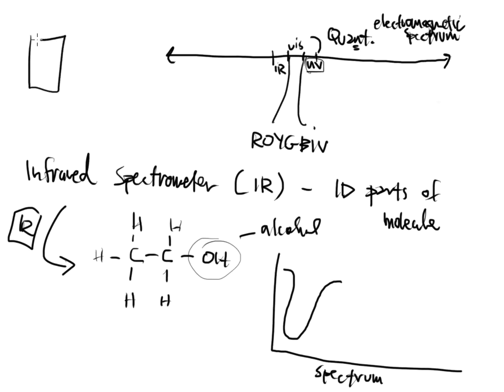So that means I can take a liquid, and I'm going to put a question mark here. I don't know really what it is. And I can run that liquid on an infrared. And if I see this group show up, I can say, hey, it's got an alcohol group. It has an OH group on it at least. An OH is present. I don't know anything else about the molecule, maybe, but I at least know that OH is present. That's the power of infrared spec. All right, now, you're probably wondering, well, what's so special about this, right?